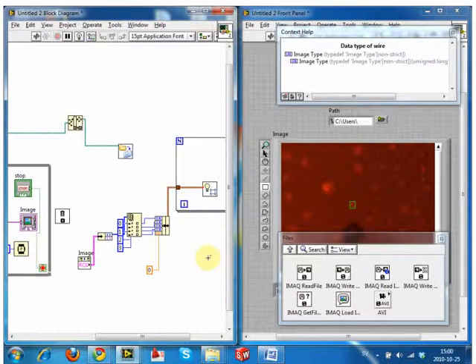It'll treat it exactly the way it would in Photoshop: if you right click and say make grayscale, it does use all channels. Since this was done with the color camera, technically you should do it this way, rather than extracting one of the channels, because we don't know if it was coming from a different color channel.